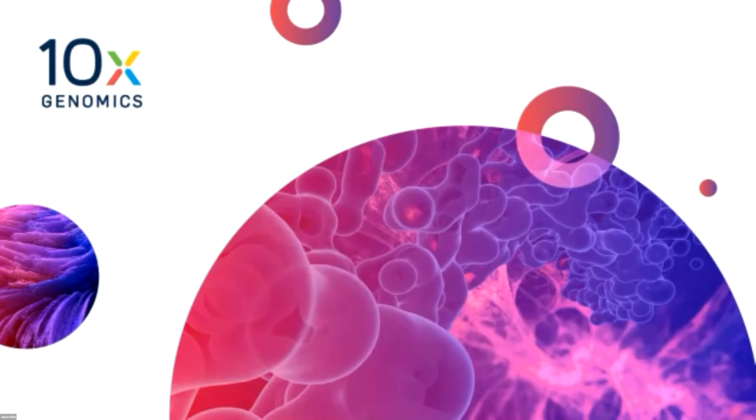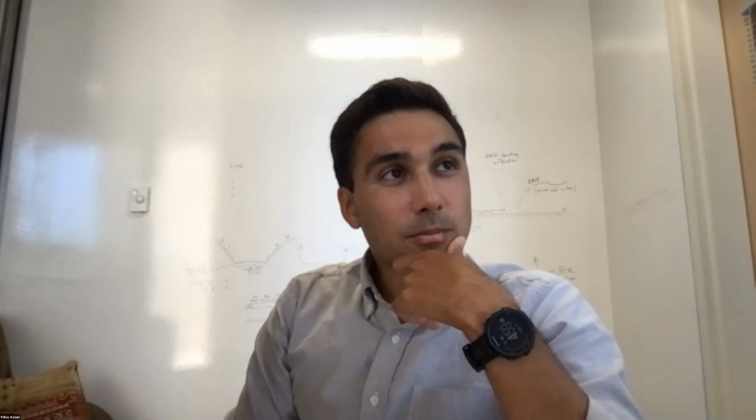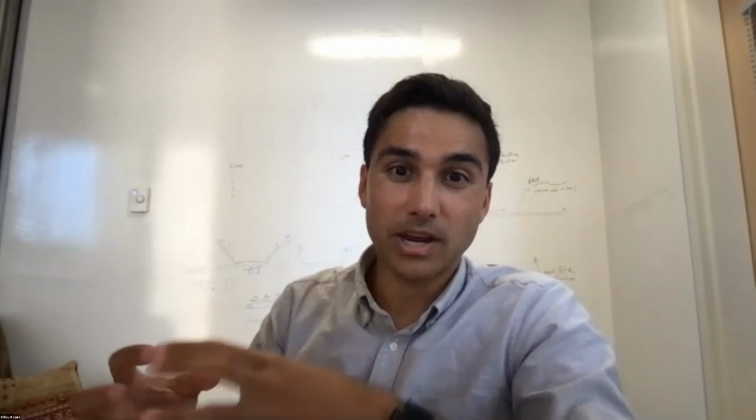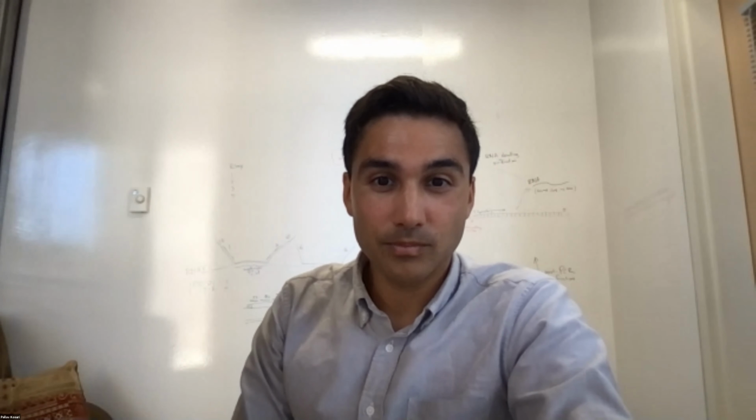I have a question. Sure. Go ahead. Yeah, I'm wondering. I know Fei Chen published this paper relatively recently on using a computational method to deconvolve the different cell types that might be combining on each bead in your setup. Have you used that a lot? Is that compatible with your platform? And if so, how well does it work?